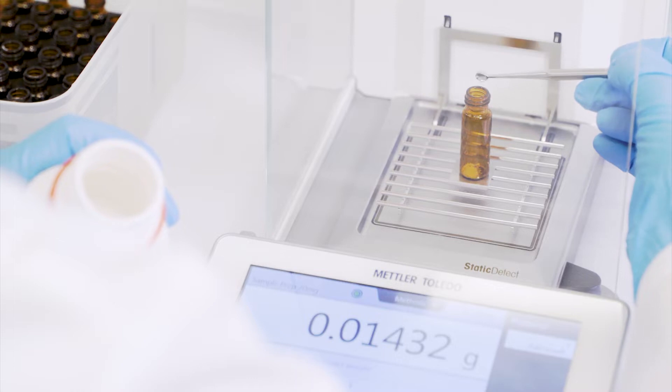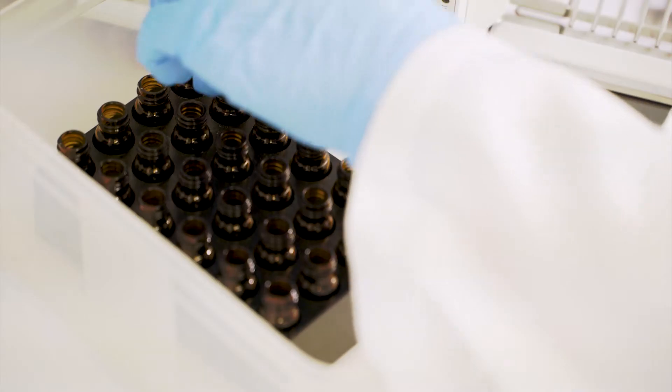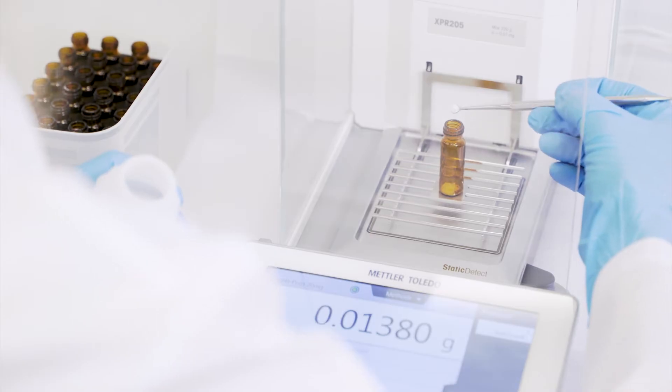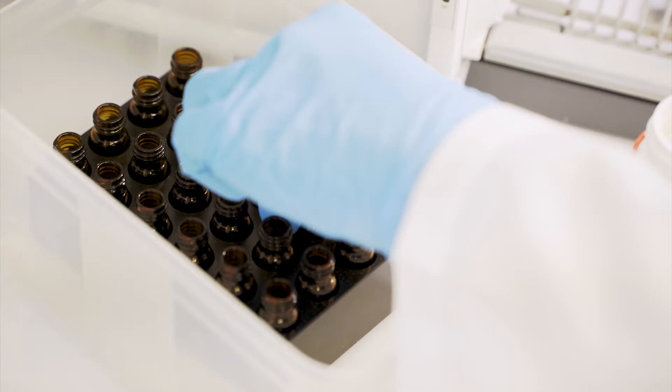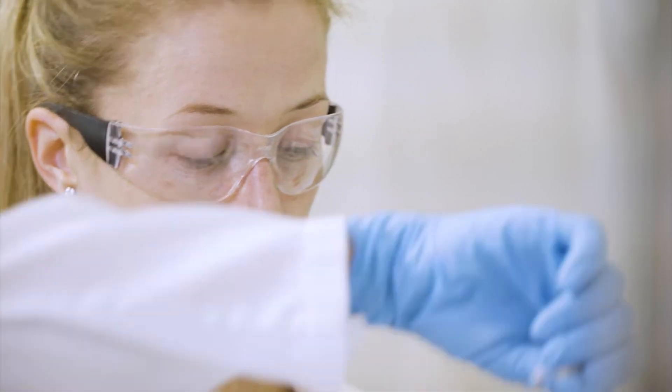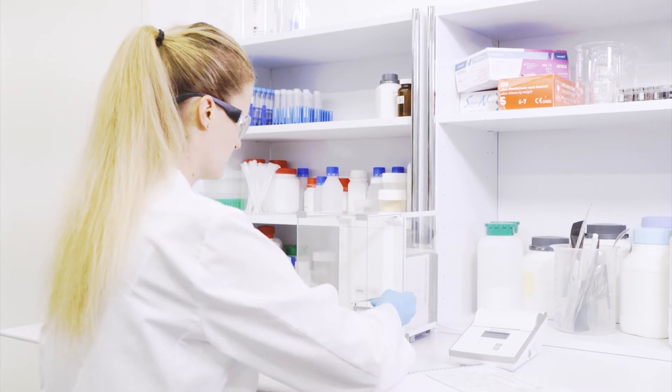Manual preparation of powder components used in these reactions is tedious, time-consuming, and repetitive. Avoiding errors requires significant effort and concentration. Automation and robotics relieve scientists, improve accuracy, and enable faster product development.